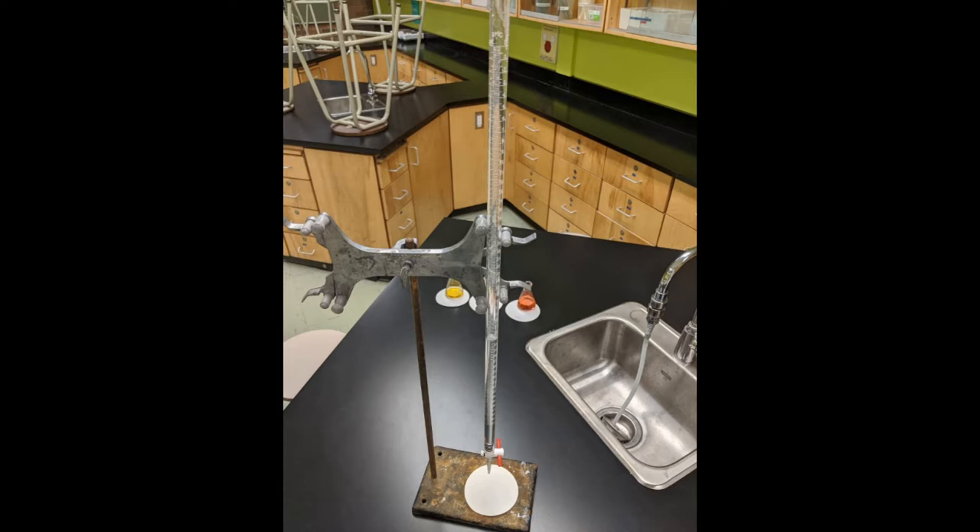Down here we have the tap, which will turn to allow liquid to flow out of the burette at varying rates. Behind you can see a few different examples of previous experiments that we're going to compare to when the trial actually takes place.